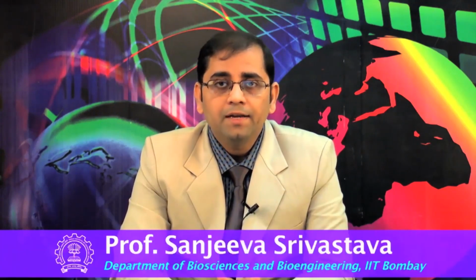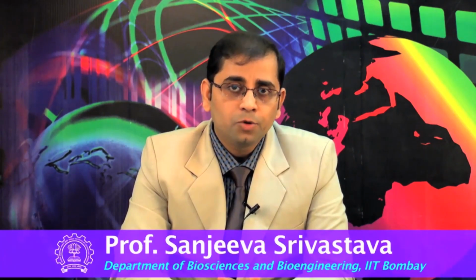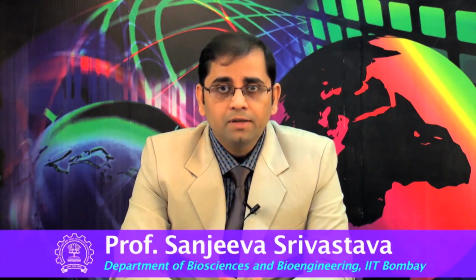In the next lecture, Dr. Klauser will help you appreciate the importance of sample preparation, and then move on to quantitative proteomics with the use of iTRAQ and TMT labels for quantitative proteomic analysis. Further, he will talk to you about the use of various search engines in protein identification.